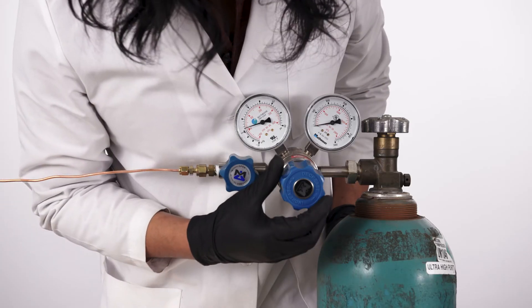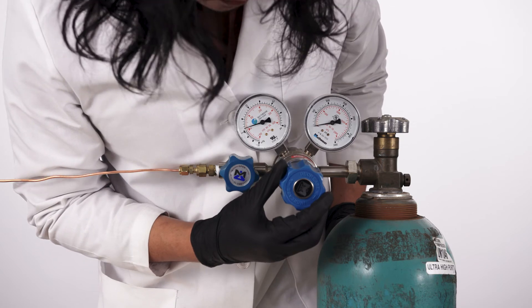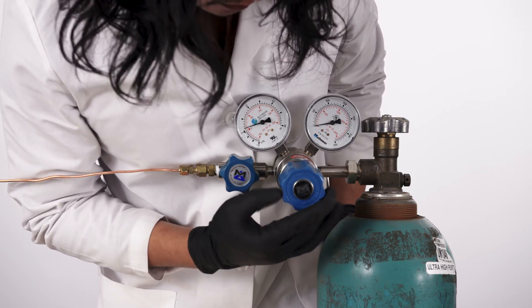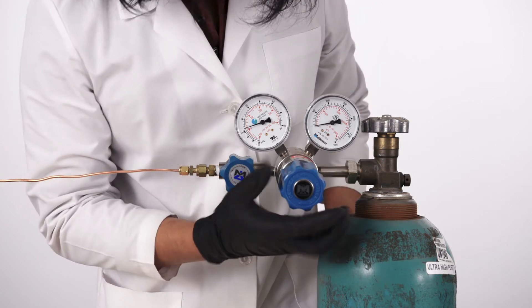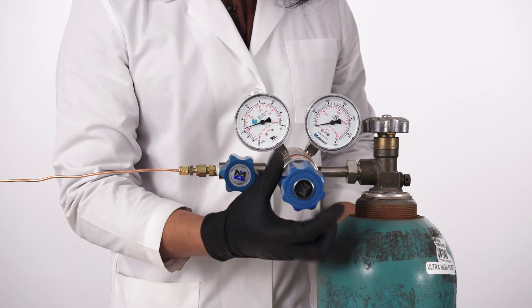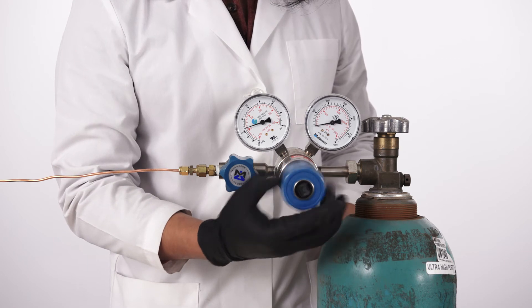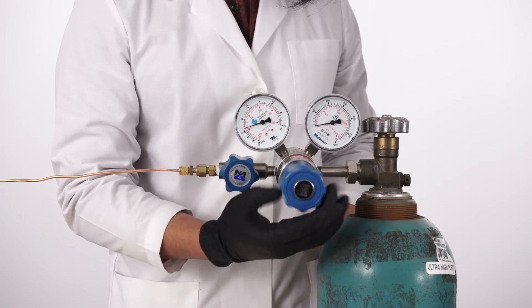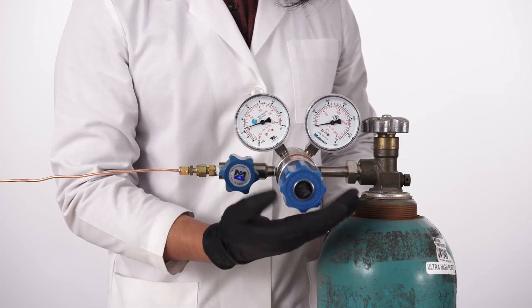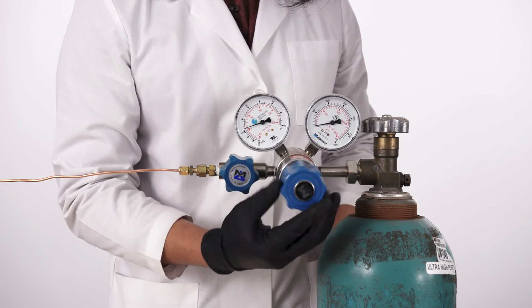First, check that all gas lines are connected. Then, open the gas regulator shutoff valve and isolation valve if installed. Keep the regulator control knob in the fully closed position.